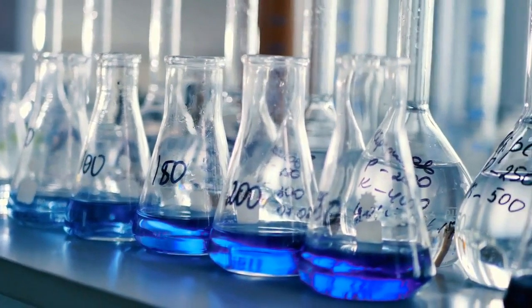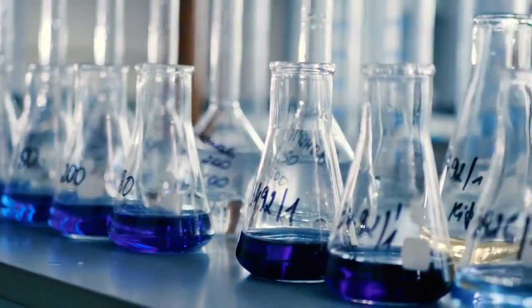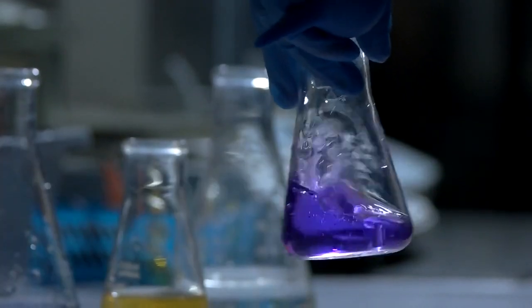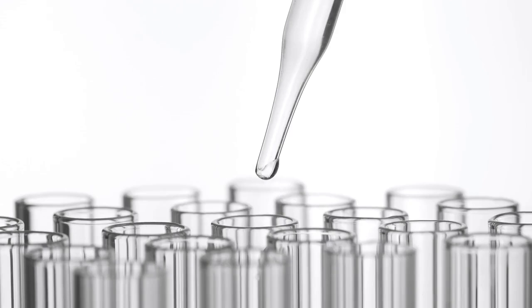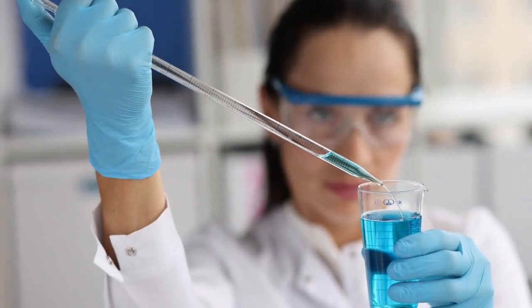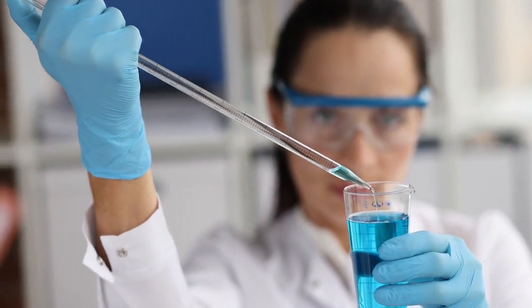Erlenmeyer flask. A conical-shaped flask with a narrow neck used for mixing, heating, and storing liquids. It is designed to allow easy swirling and prevents splashing. Pipette. A slender, calibrated glass or plastic tube used to measure and transfer small volumes of liquids.